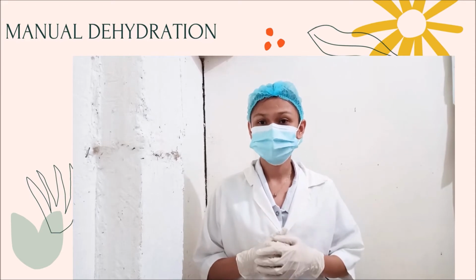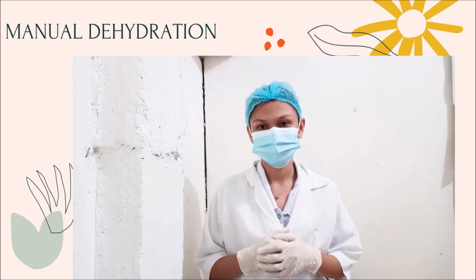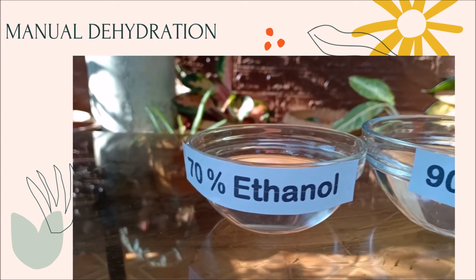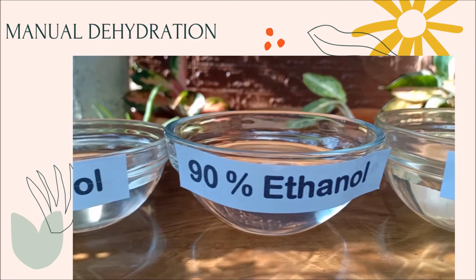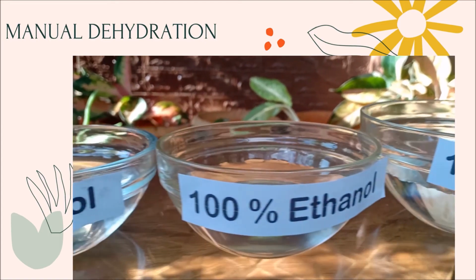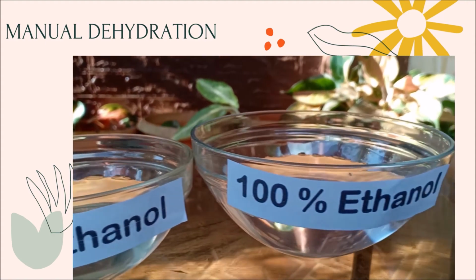The next step after decalcification is dehydration. At this moment, we will perform the dehydration process. Dehydration is the removal of water before infiltration. It is the process where the specimen is immersed in increasing alcohol. We must always note that tissues must be immersed in increasing concentrations of alcohol to prevent mechanical damage to the intracellular structure of our tissue specimen.